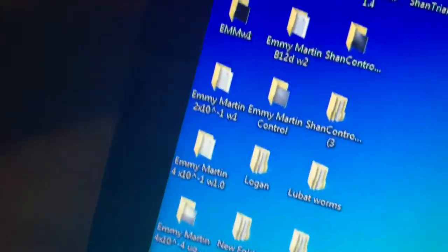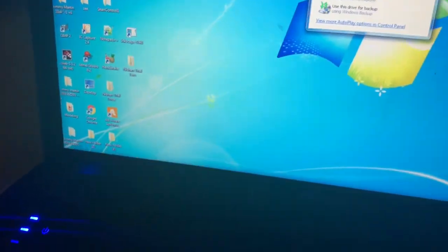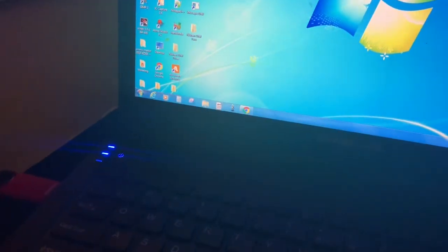Just give me a second. So now you've plugged it in. You should go into this little folder right here with this little icon. It's like a little folder tab. Give me a second. Okay, there we go.